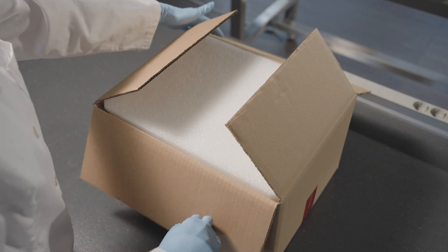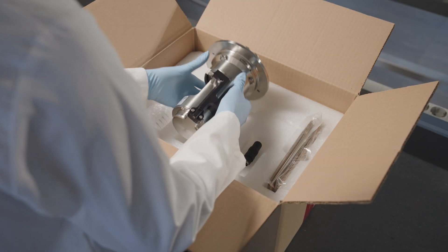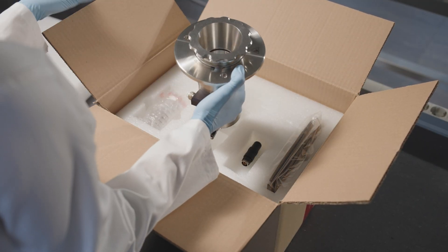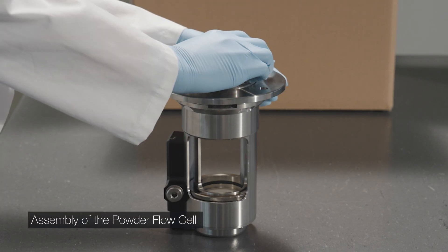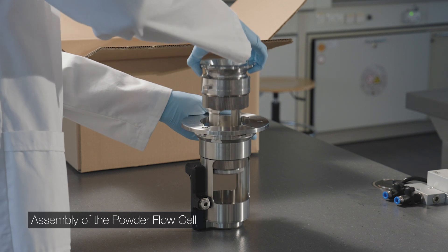First, unbox the envelope density setup. Unlock the powder flow cell from the cell holder by turning it counterclockwise.